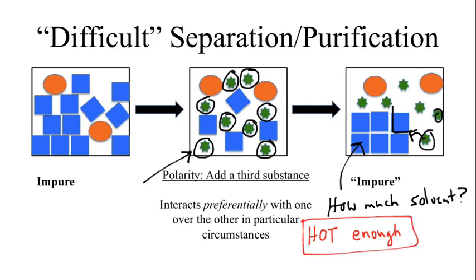The only way we can get you a magic number is if it's done a thousand times over and we figure out exactly how much to use, and then we insist that you measure out exactly that much. The odds that that's ever going to happen are really, really slim. Whenever you see a recrystallization procedure, it's hot solvent and just barely enough to get it to dissolve.